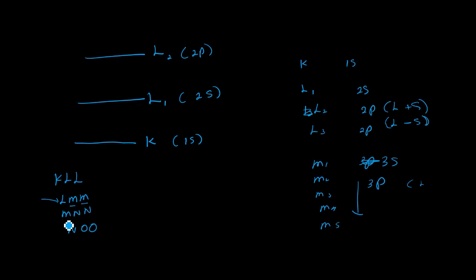In MNN, the M level electron comes out first, and both the electron that comes down and the Auger electron are in the N level.